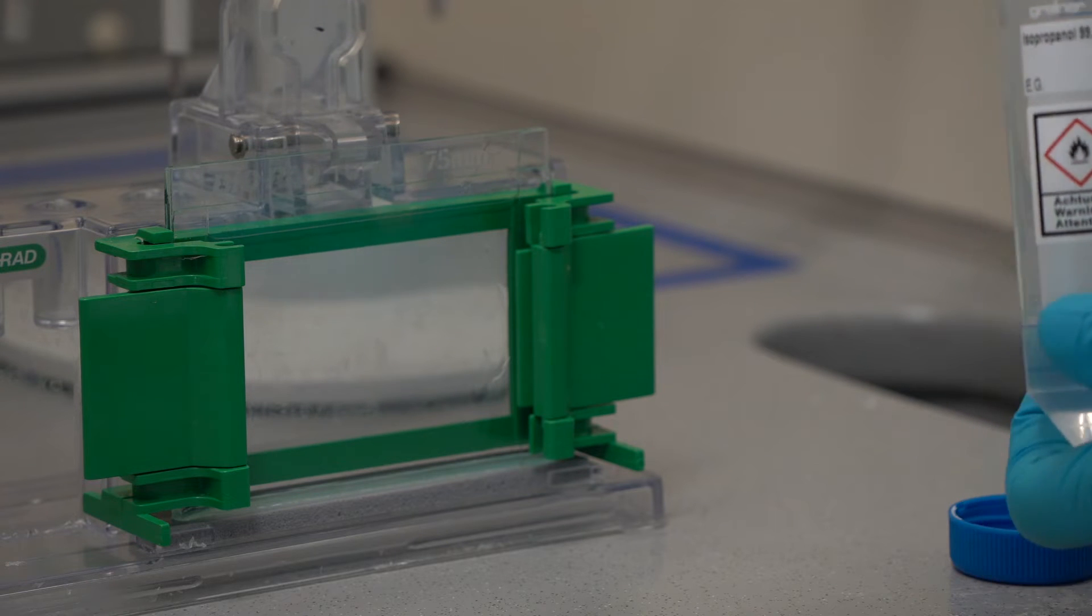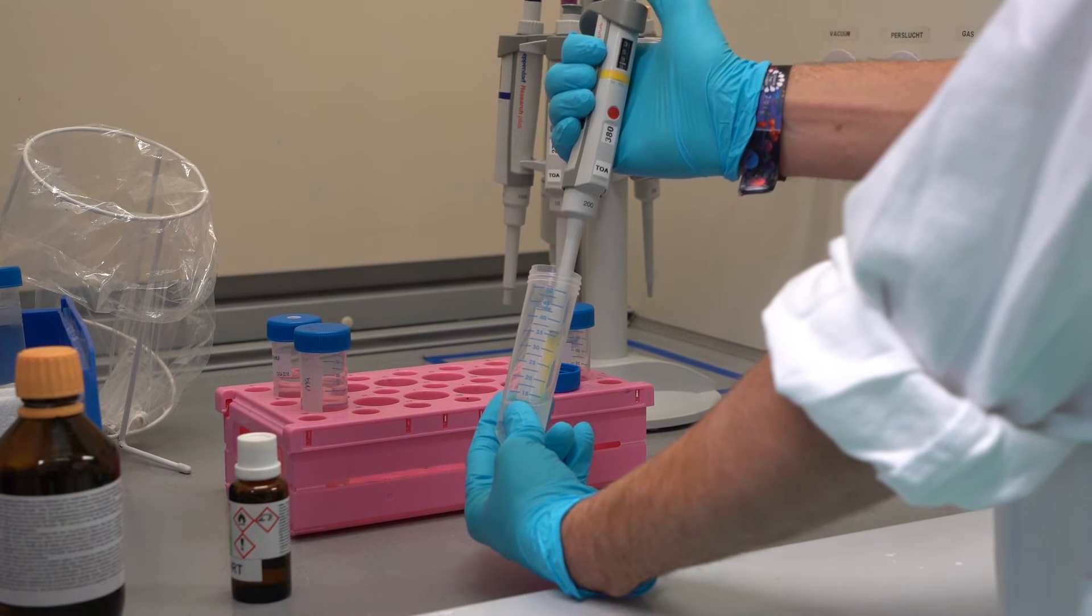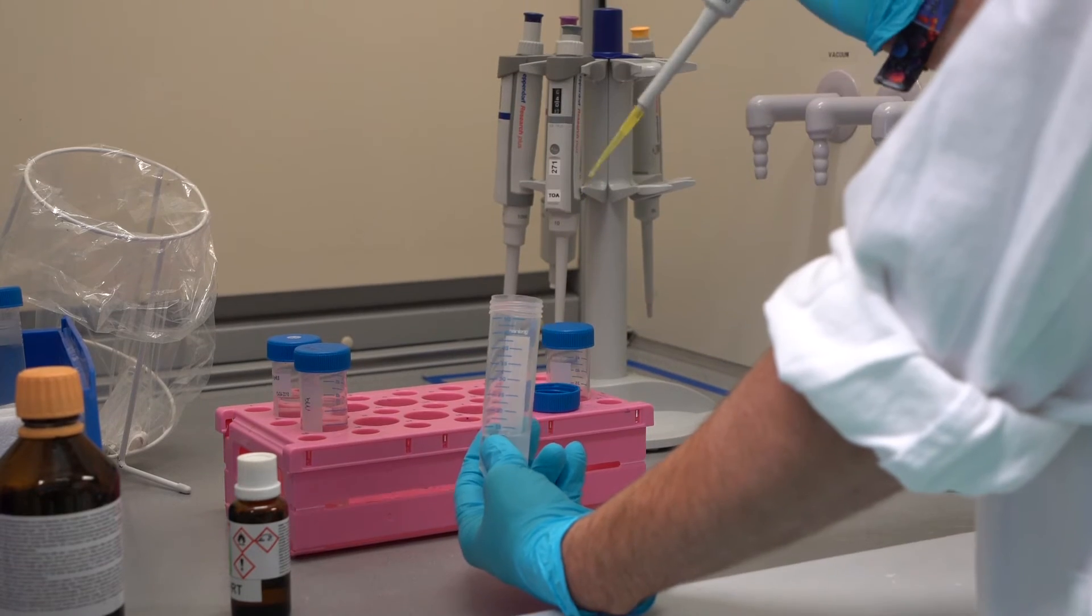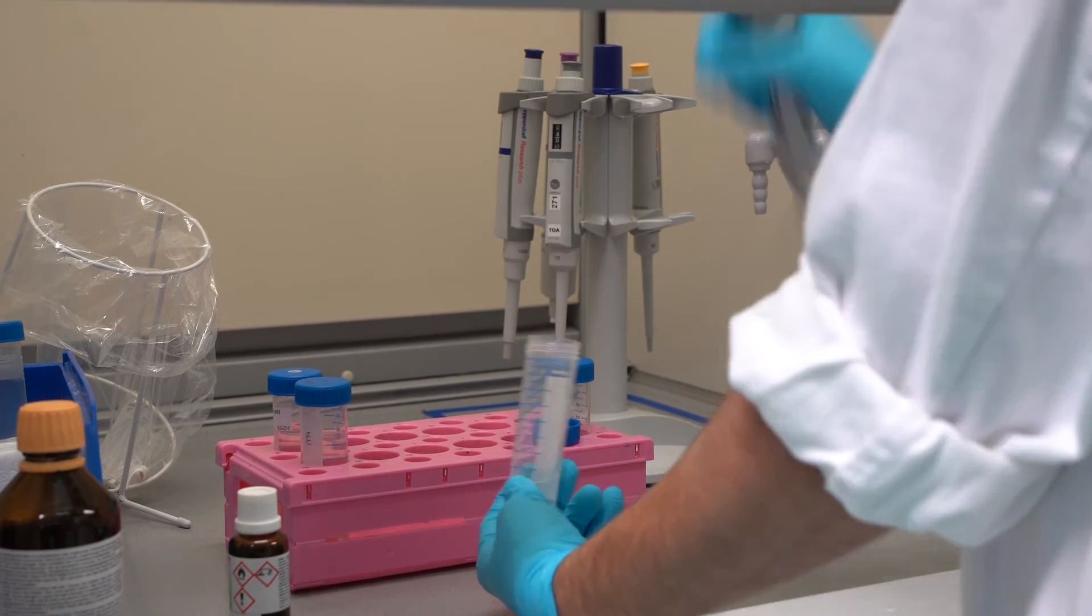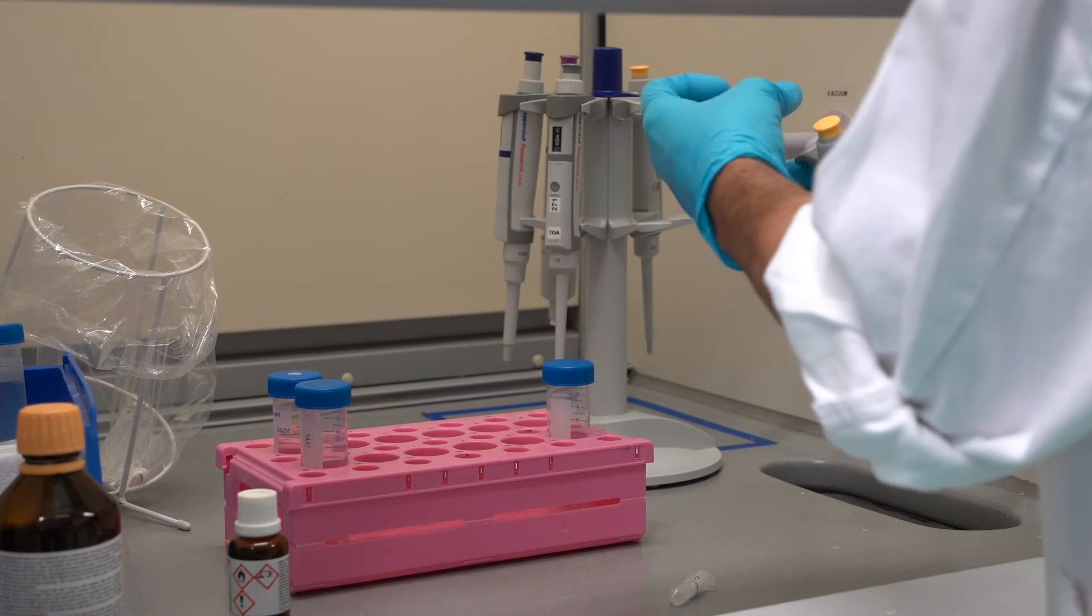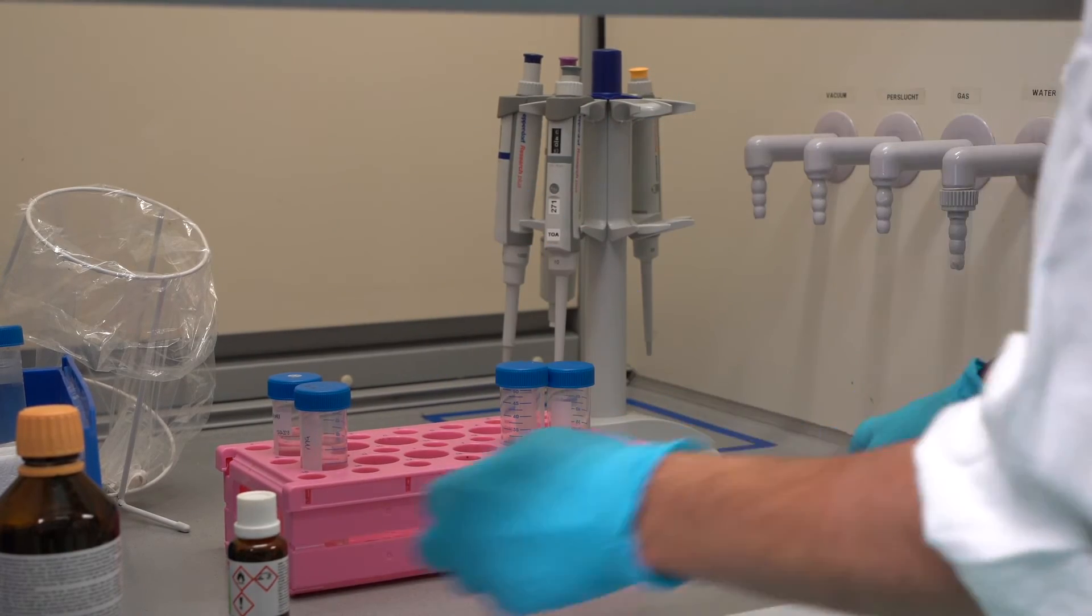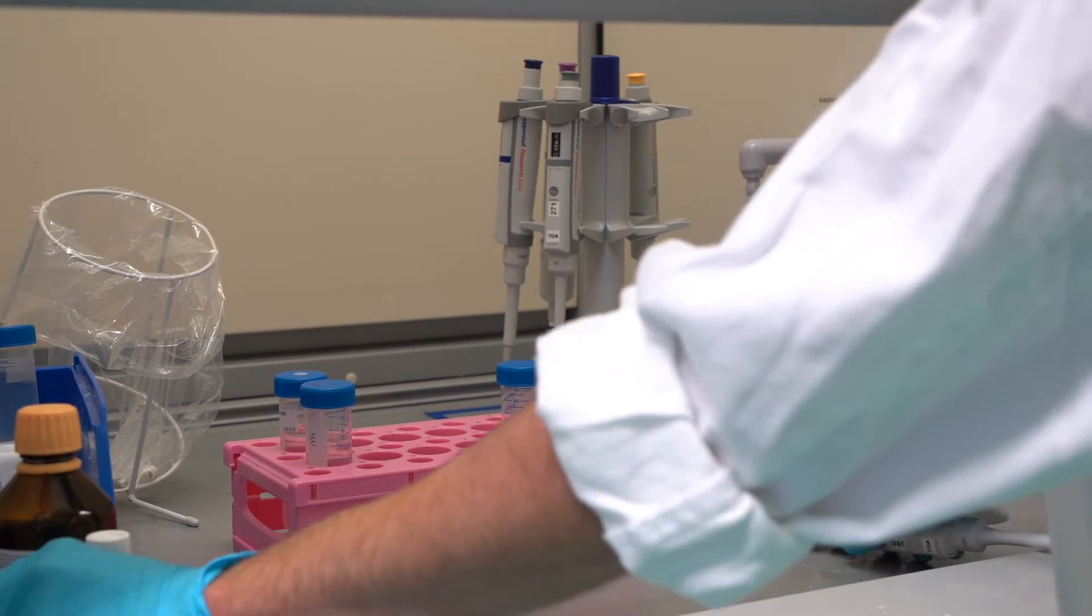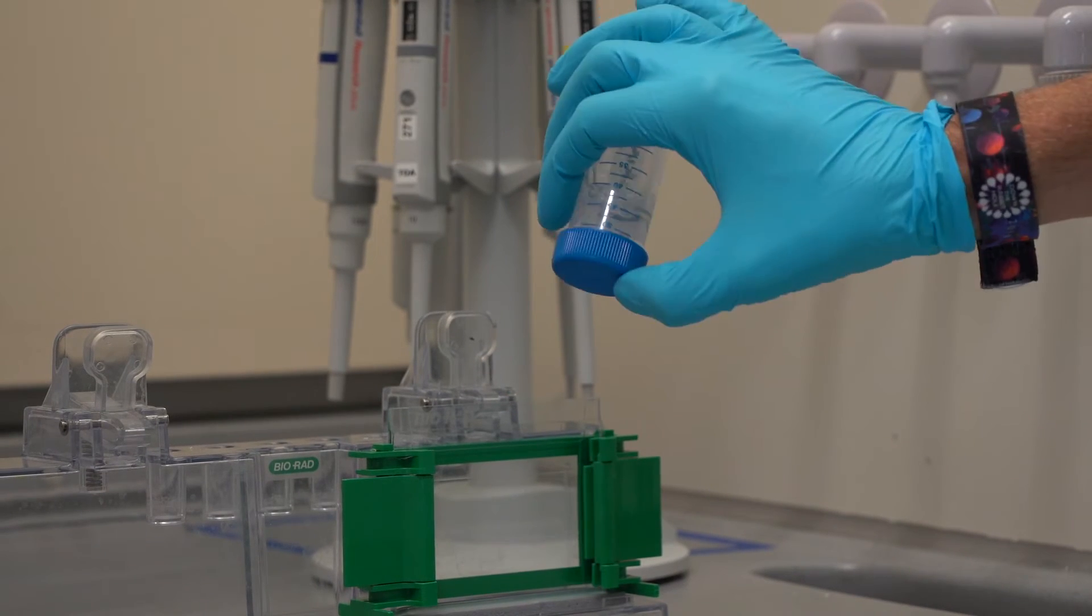The stacking gel is made during the polymerization of the running gel. Calculate the volumes needed for making the gel. Pipette the right amounts together in a falcon tube. Pipette the Temed and APS in last as this ensures the polymerization of the gel. Mix the solution by inverting two times.